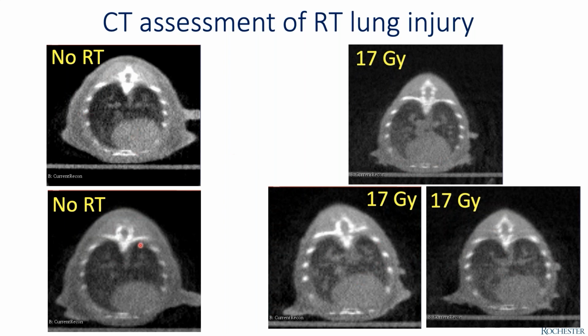So we're developing an approach to correlate these changes on the CT with histopathology of fibrosis markers. And the aim really here is to define a non-invasive way to allow us to look at fibrosis and see when we should sacrifice an animal to do the histopathology. So this is in development, and I'm sure we'll talk about this later as this work develops.